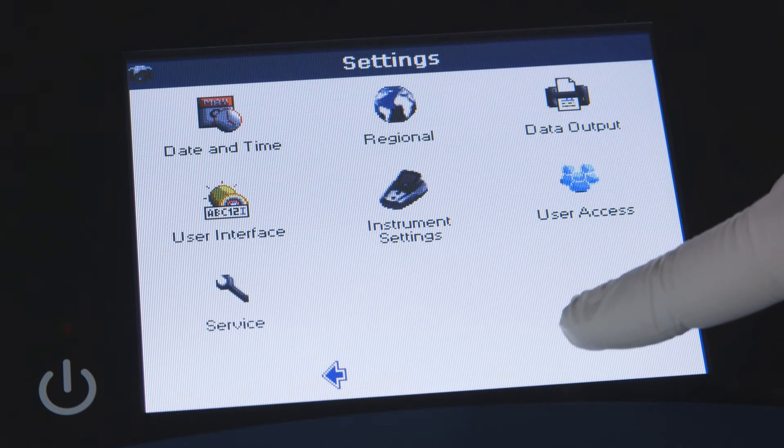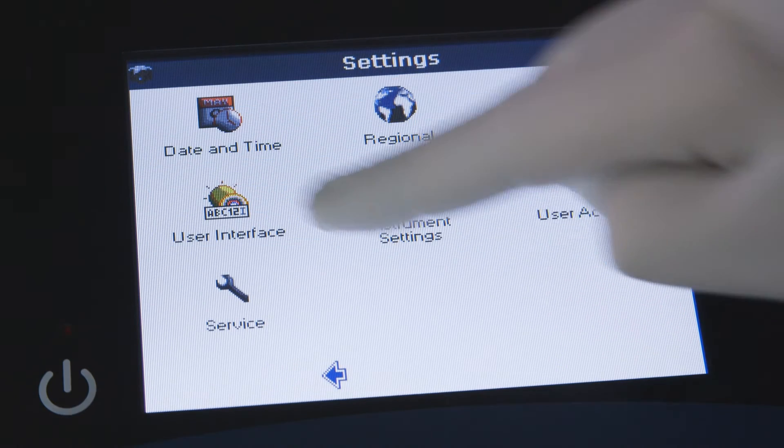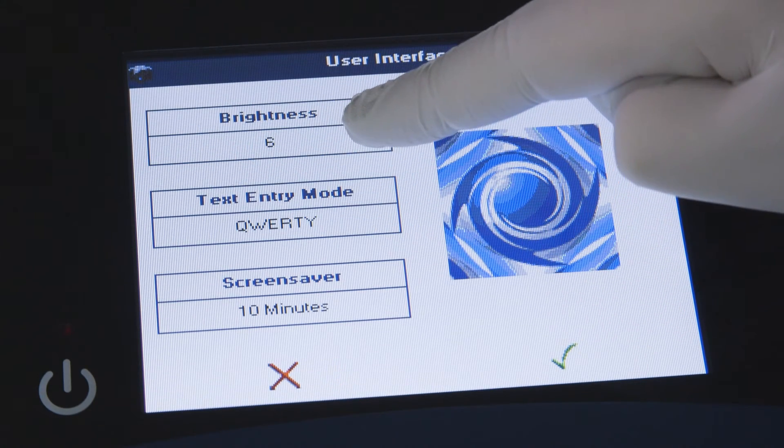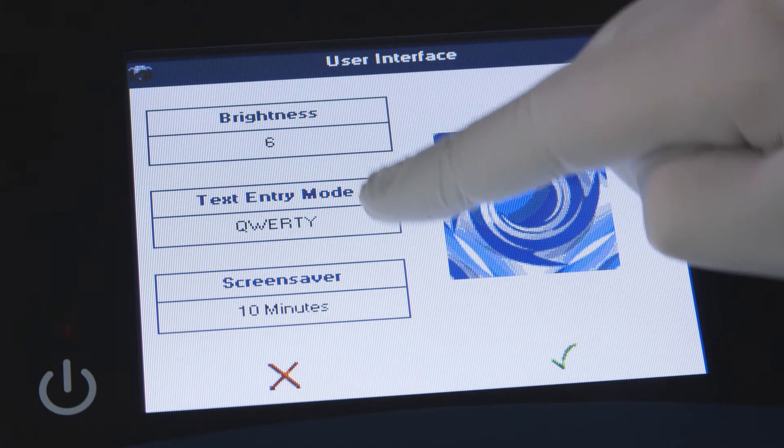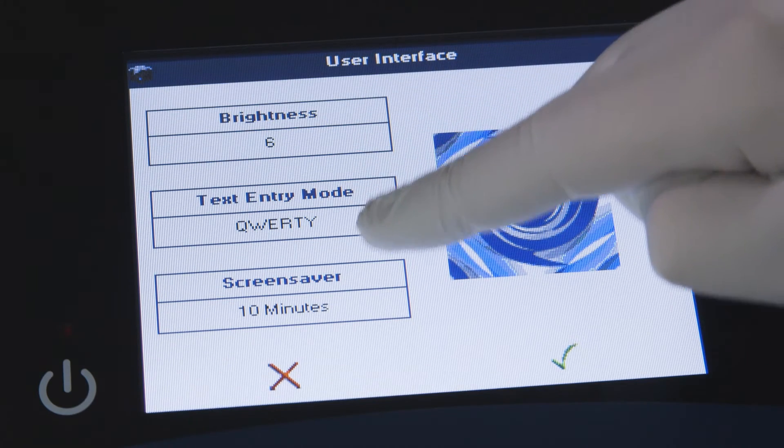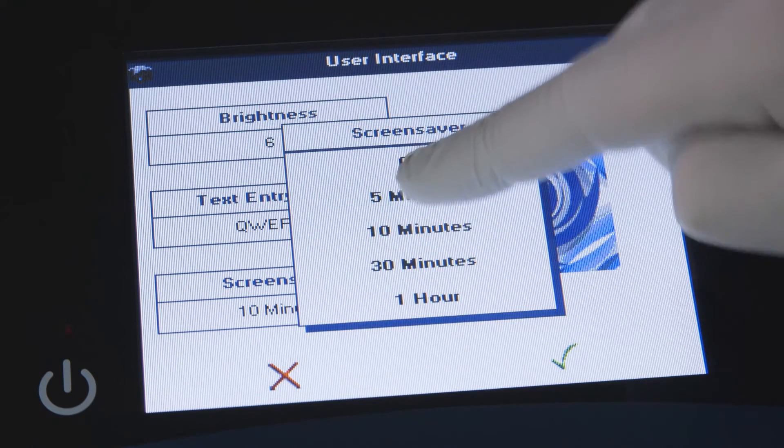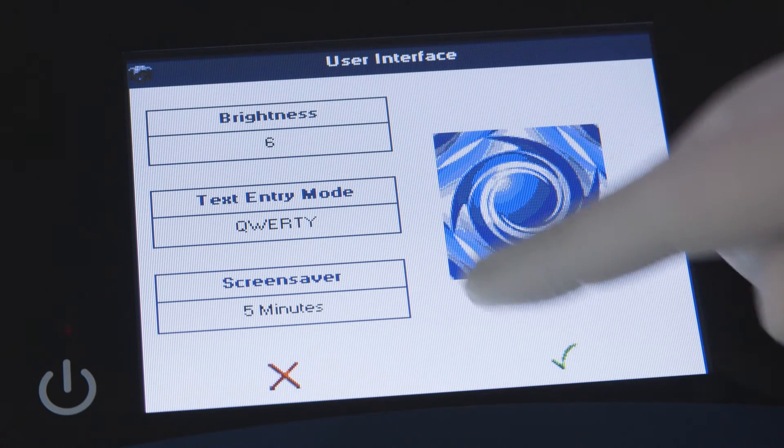In the user interface menu option, you may specify screen brightness, text entry mode, and screen saver activation time.